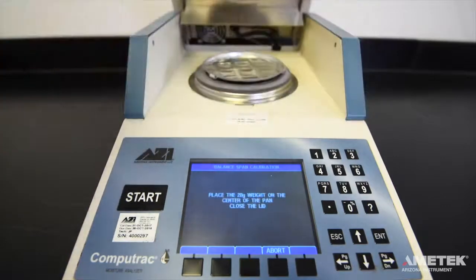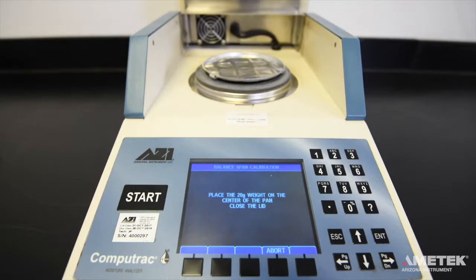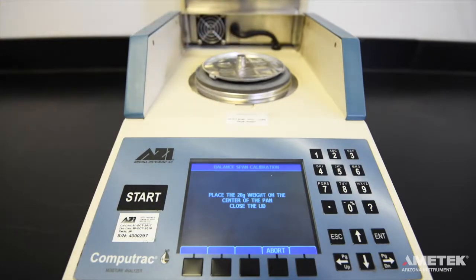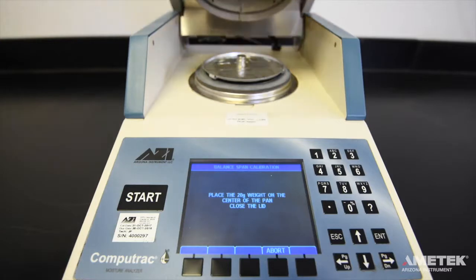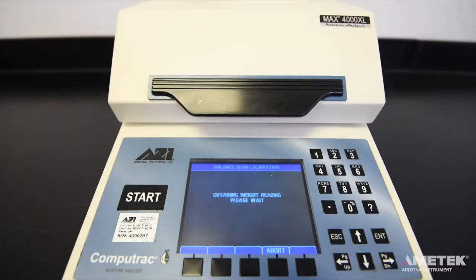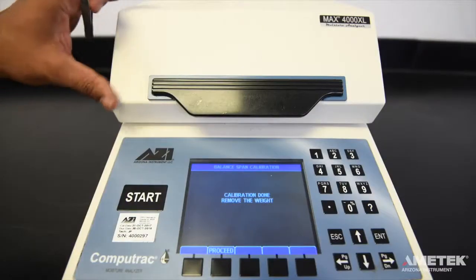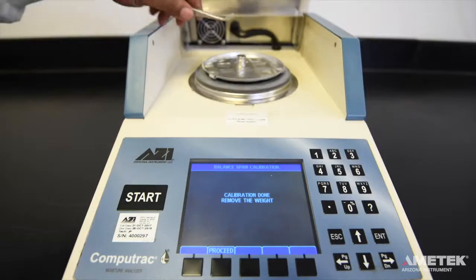Repeat the addition and removal of the 20 gram weight as directed by the instrument. The first round was to calibrate the balance. The second was to verify that the calibration was successful and that the balance is working properly. Throughout the process, it is important to avoid putting excess pressure on the balance. Continue to follow the on-screen instructions until the span calibration has been completed.